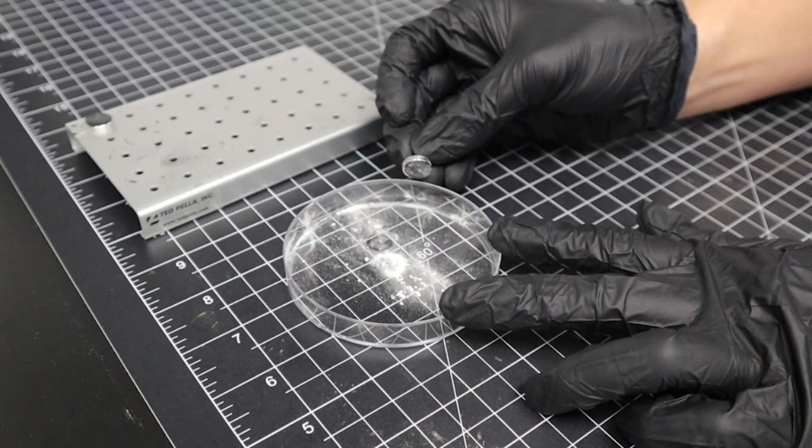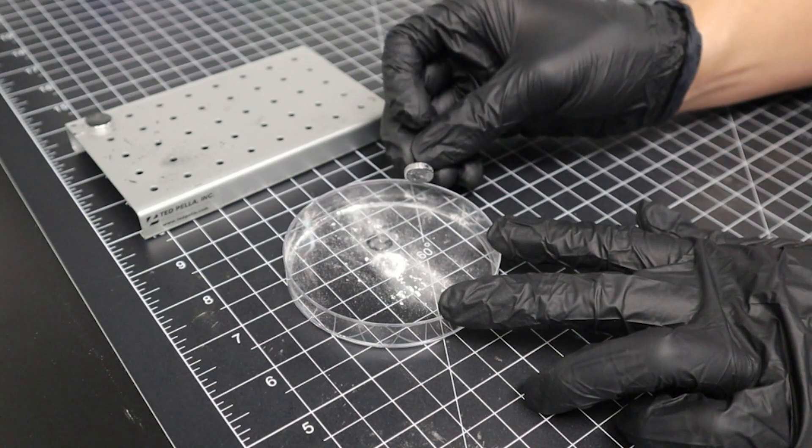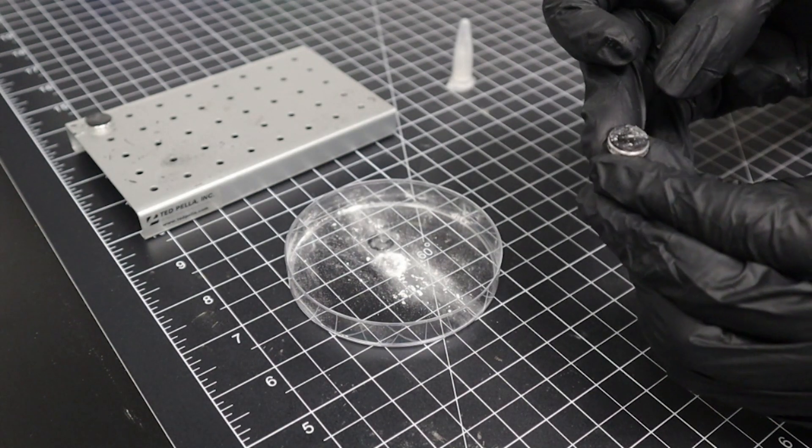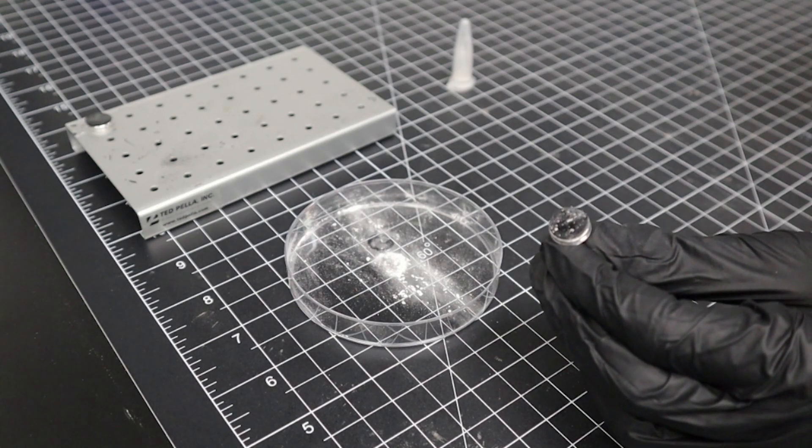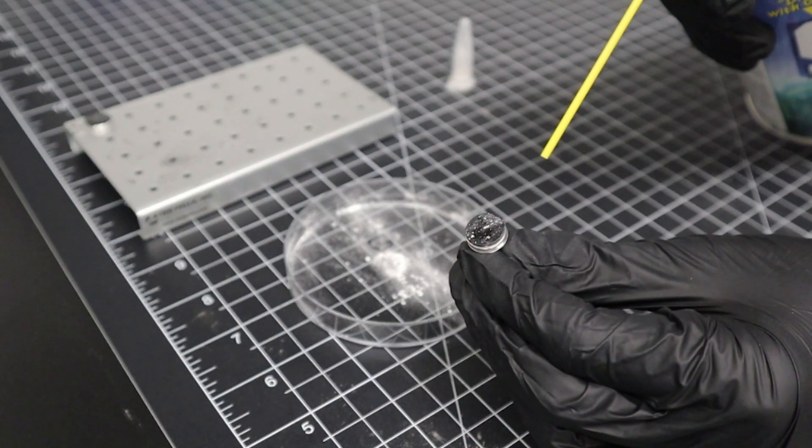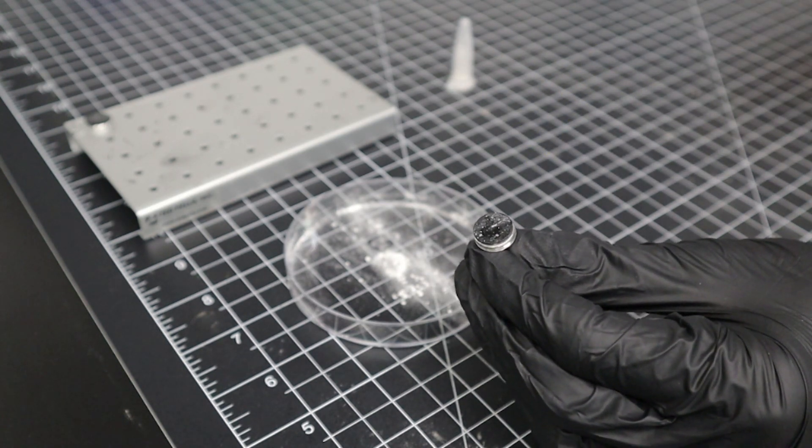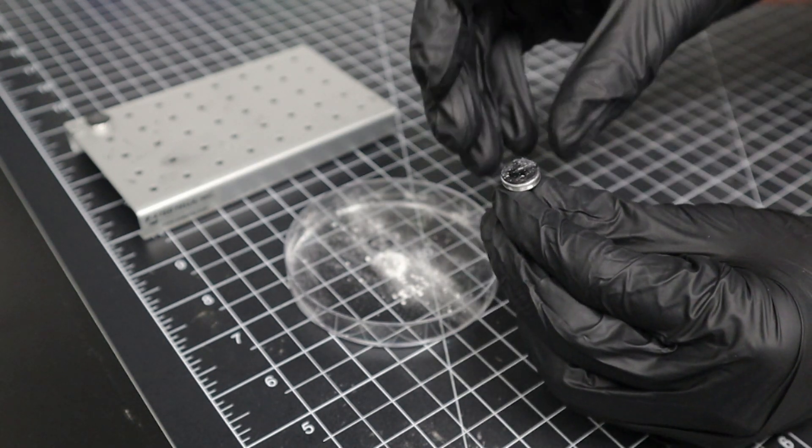Tap the side of the stub to the edge of the petri dish to dislodge any extra particles. And then we can remove the rest of them using the can of compressed air just like we did with the flick method. This sample is now ready for analysis.